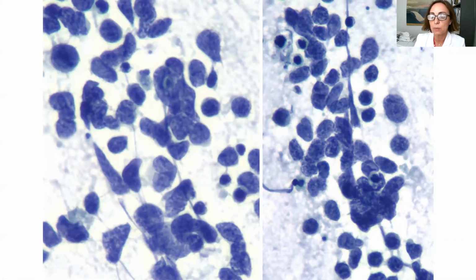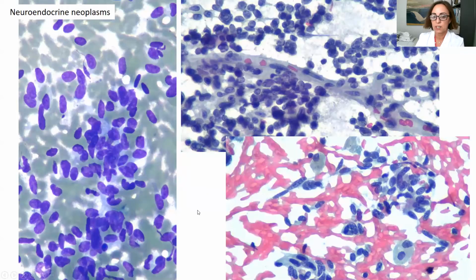In the small cell carcinoma, there are cells that are not so small, in this case here, but the nuclei of these cells are the same as the other cells. So this is, I think, a very nice picture with all the cytological characteristics of a small cell carcinoma.